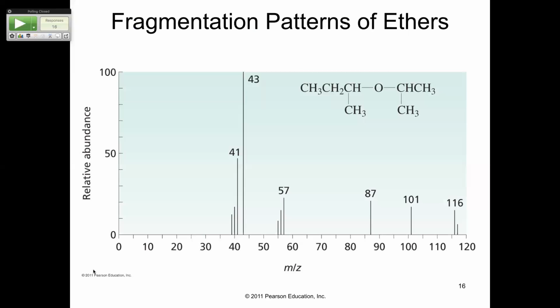You could lose a methyl off either side. Okay, you get the same weight. It's not going to say this is the same weight as this, but the structure's a little different. It doesn't detect it like that. It's going to put them together. So whether you lost a methyl over here or over here, it'll be the same weight.